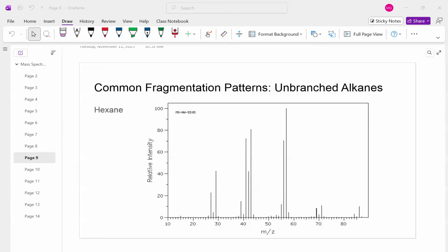And again, the goal of mass spec interpretation is not to identify every single signal that you see here. That's impractical and it just doesn't get you anywhere. But you should be able to tell what the major fragments are, at least the biggest, where the molecular ion is, and at least what the base peak represents. What is the fragment of the base peak?